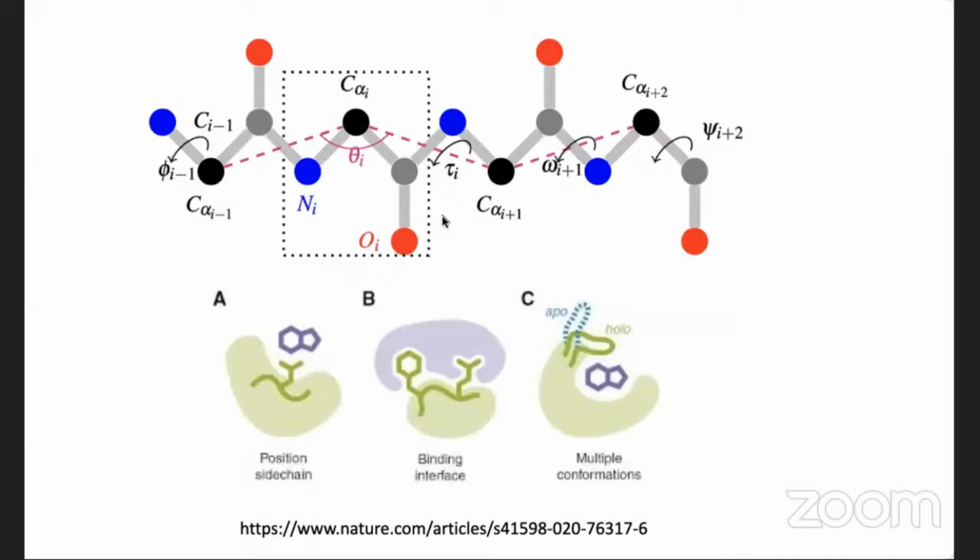And that's what I was discussing in this slide: what we have been used to is structure based predictions, and those predictions are based on multiple sequence alignments, then finding similar structures, and then modeling using them as a template. That has been a common practice using either Modeller, Swiss-Model, and all of that, which works really well for closely related proteins. Now, the recent achievements, and this is where everyone should know, are from the ongoing surge of deep neural networks. Deep neural networks in research in general have huge implications and have been used so widely. So today we are going to review some of those aspects of how the advancements have come up in deep neural networks.